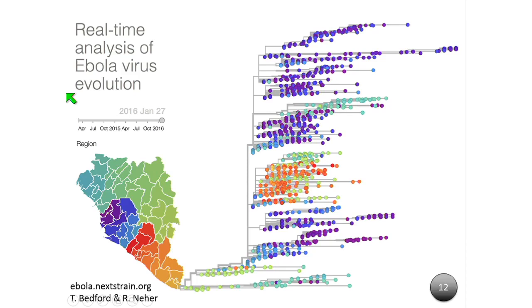And what you can see is, in terms of human genetics, Ebola mutates at two SNPs every month. Okay, so what that means is over 2 years, this is the amount of diversity that's generated in our cases. And you can see very clearly there's a very strong geographical signal associated with these genome sequences. The Liberian clade very much in the center there. Various different lineages associated with Sierra Leone and Guinea. And our results very quickly showed that we were dealing with two major lineages in Guinea, here and here.